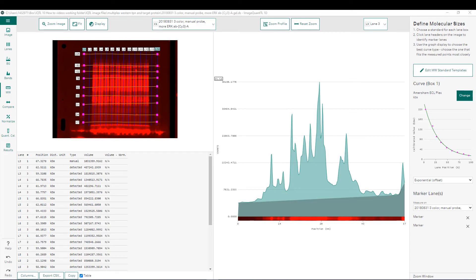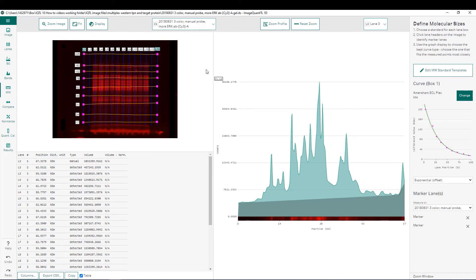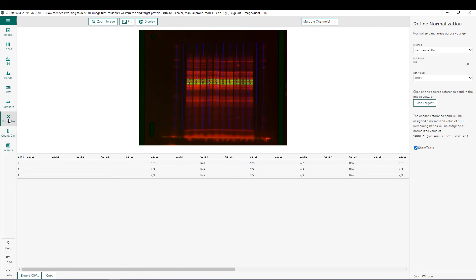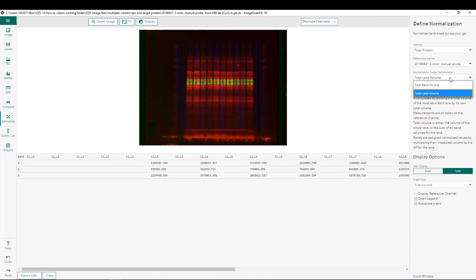Now that we've completed molecular weight determination, we can readjust our contrast settings and overlay to show both channels, then move on to the normalization step. Once here, we can see that no normalization has been applied yet. To perform normalization, we choose the method — in our case, total protein. We then choose the reference channel with our total protein normalization, which is the Cy3 channel. Finally, we choose the normalization factor denominator, which will be total lane volume because we did not detect individual bands in our normalization channel.